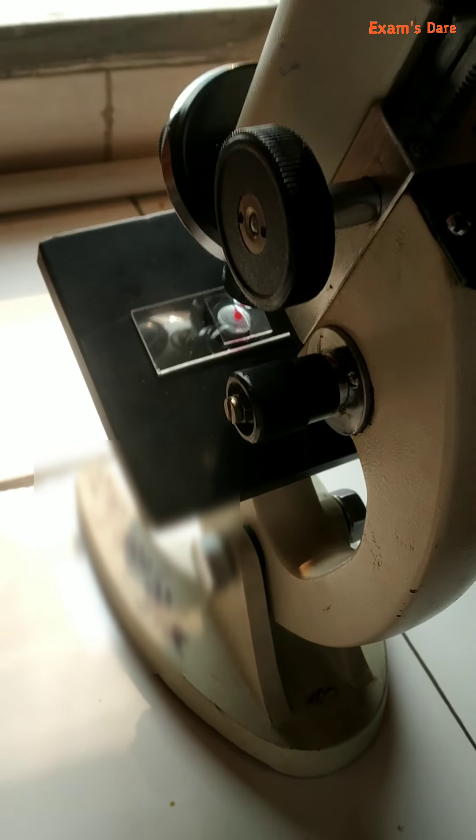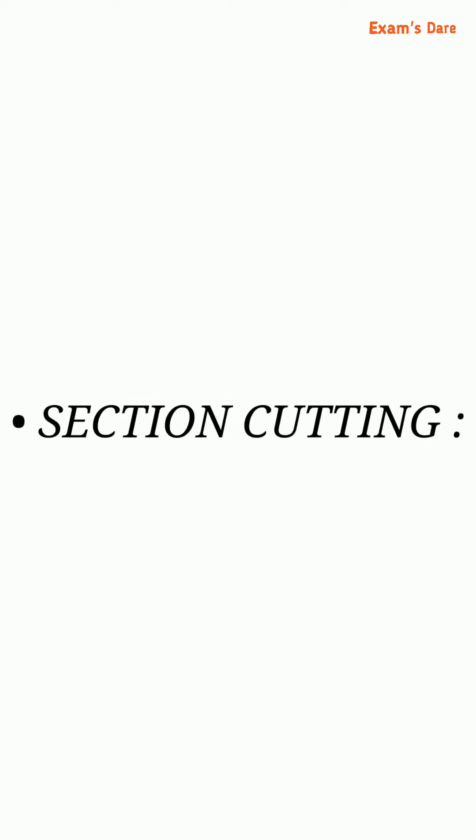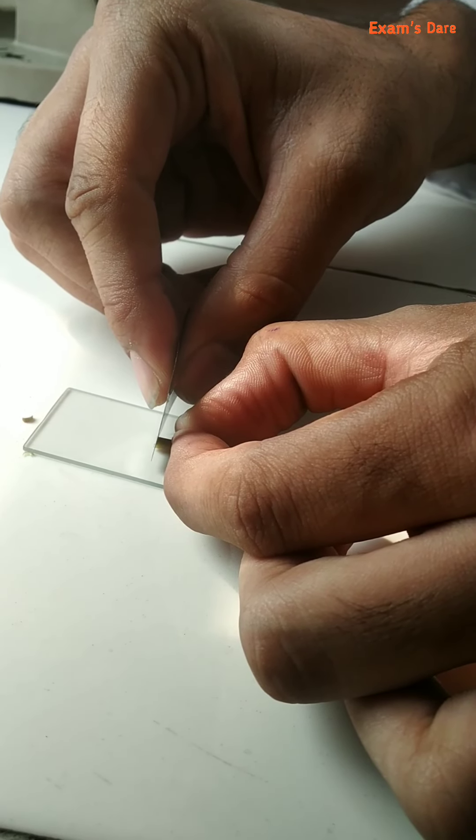Now let's start. Place the microscope near the window. The first process is section cutting. Take the section by moving the blade back and forth.